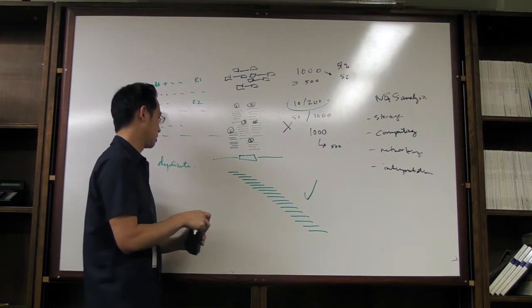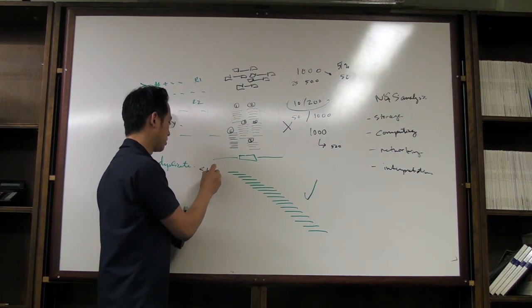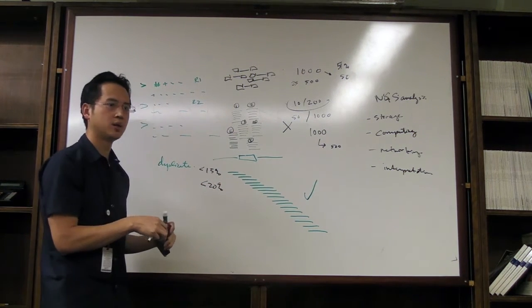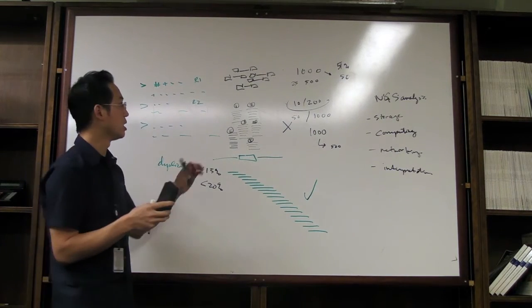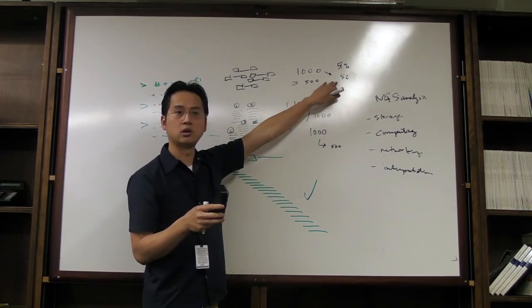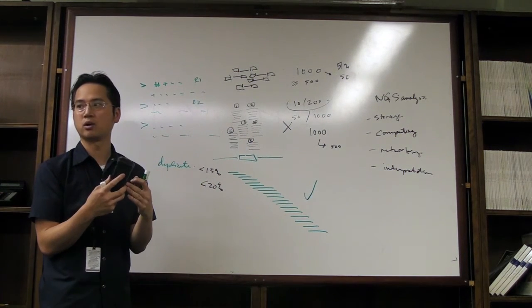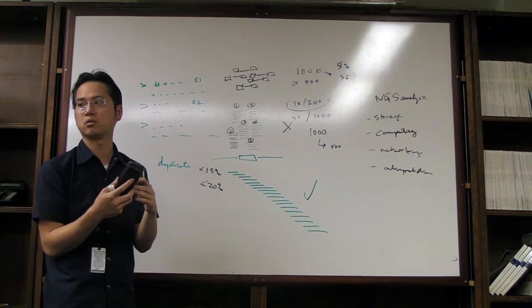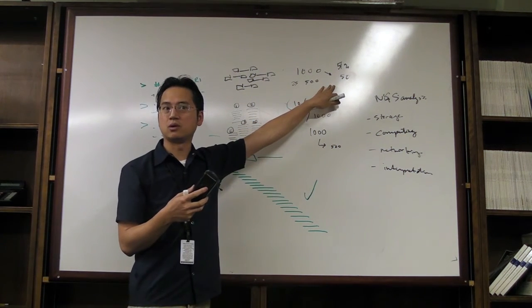And typically for a next-gen library, when you're doing something like exome capture, you probably want this to be less than 15%. Maybe no more than 20% or so. Because this will attest to a good quality, good sampling assay that you did in hopes of capturing down to low allelic frequency and being able to capture the complexity of your library that is represented by your cancer or your disease cells. For germline, it doesn't matter so much, right? Why?